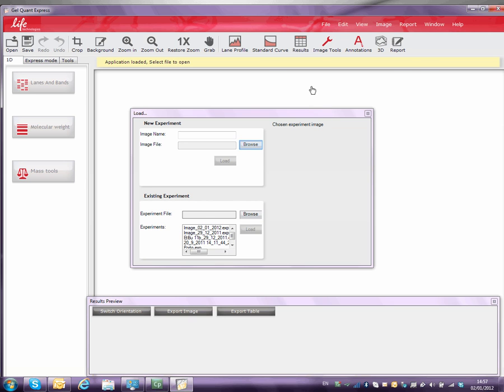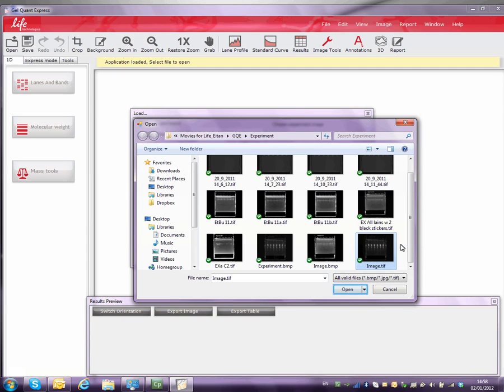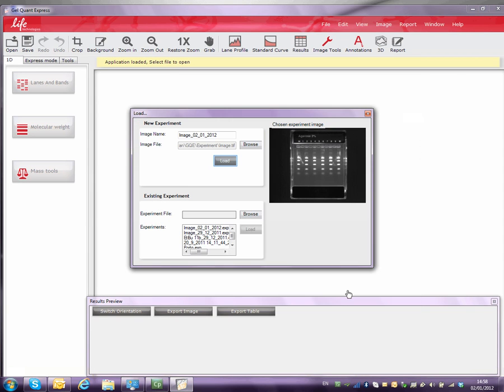To load an image, click Browse and find a saved image. Then click Load to load the image.